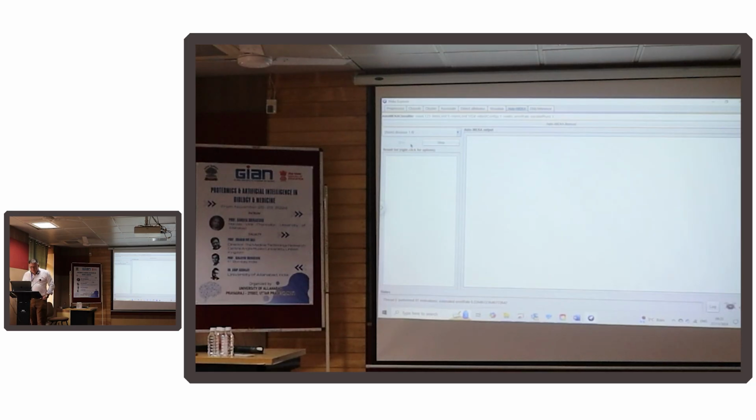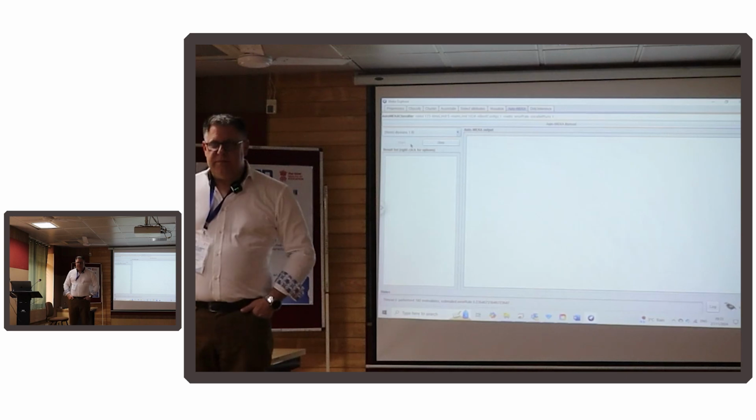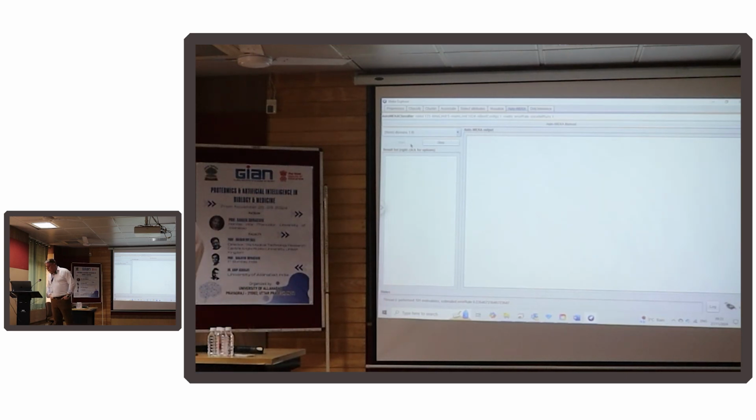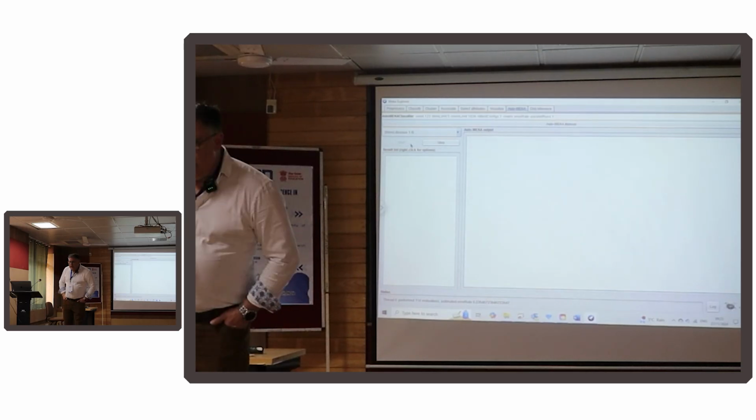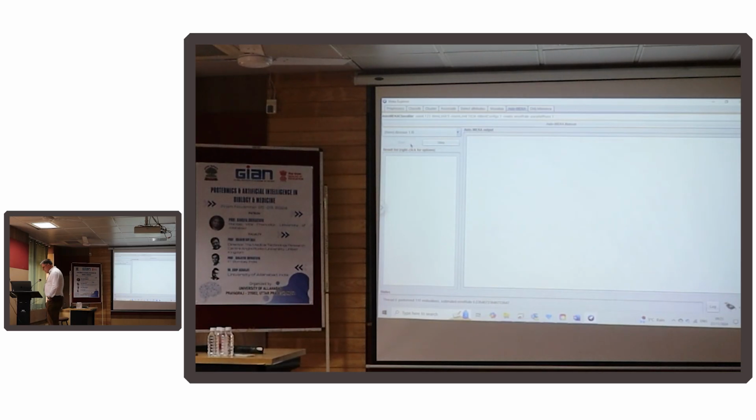So where have we got to? We've run 98 different models so far, and we've got about 23% error is the current error rate. That's pretty bad actually. Well, it's a pretty rubbish data set. I made it for this purpose and wanted it to be noisy. So it's running, we're finding results. We can come back in a little bit and see what we're getting.